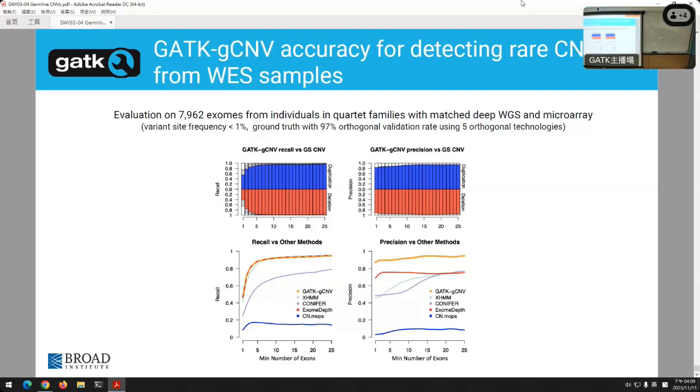Yeah. So my second question is, is the CNV state of the reference genome important to identify the CNV state of the samples that map to that reference genome? So if there are duplicated regions in the reference, how would that impact it?